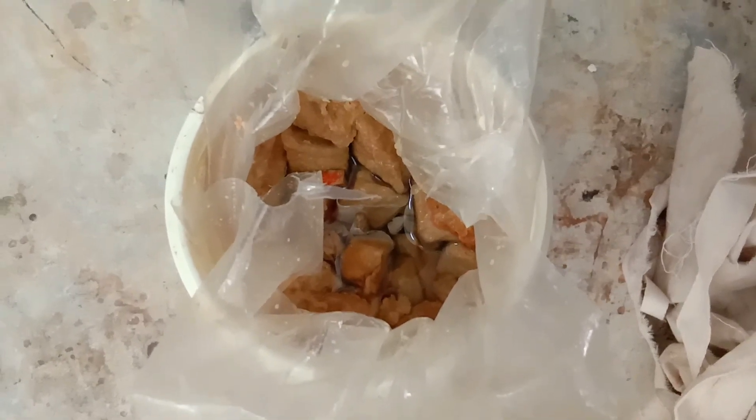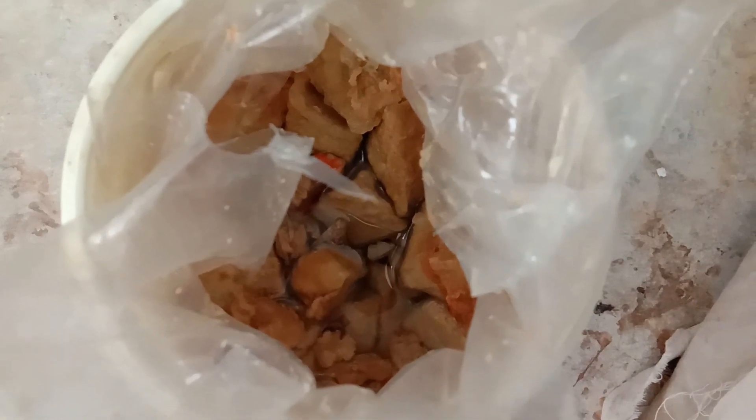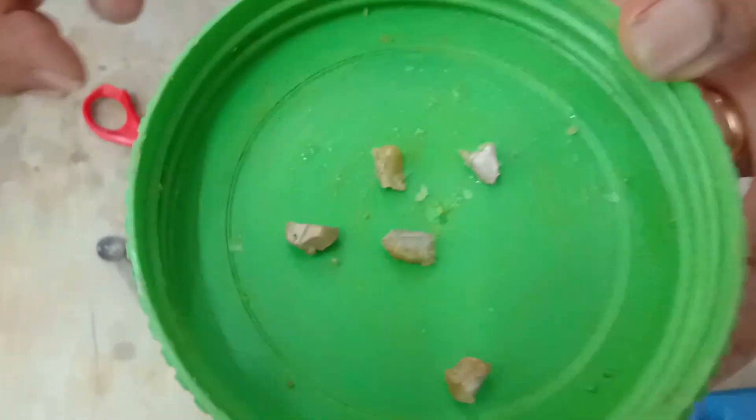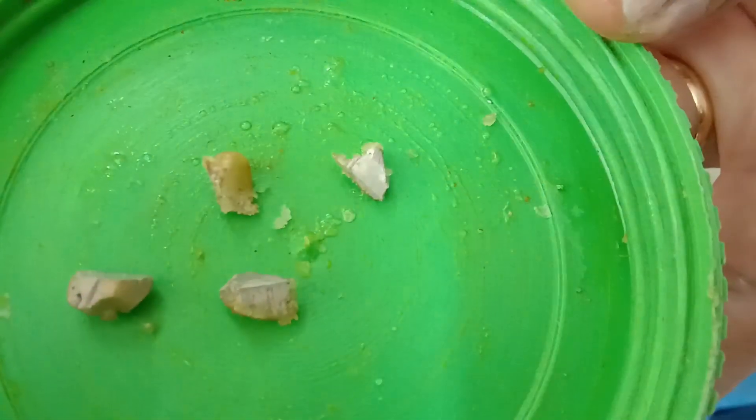Hi scientific audience. This is sodium, which is stored in kerosene because sodium is a very highly reactive metal. It can't be kept outside in the air — it vigorously reacts with the oxygen in the air. So I have taken a piece of sodium and cut it into small parts.